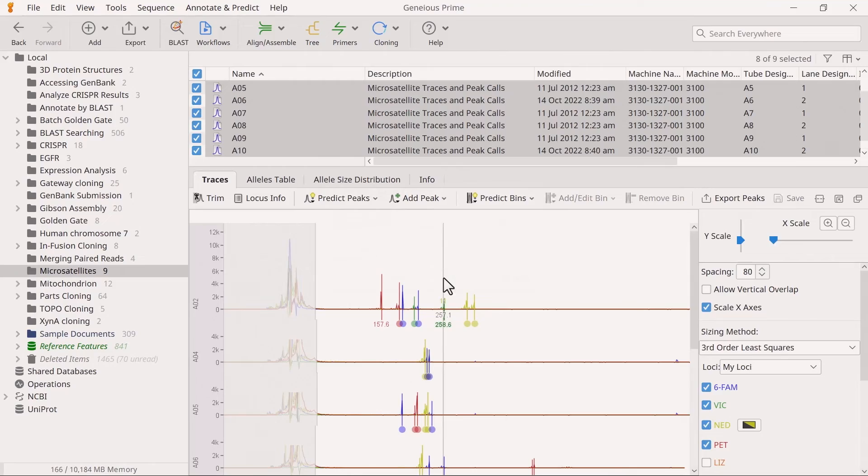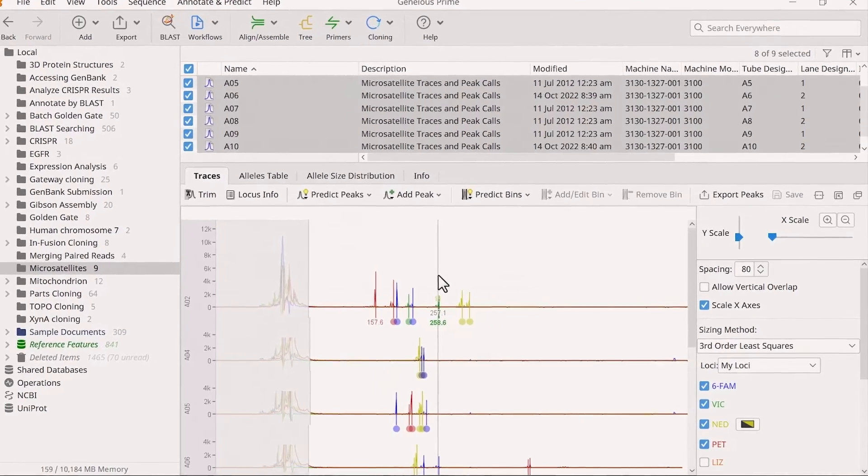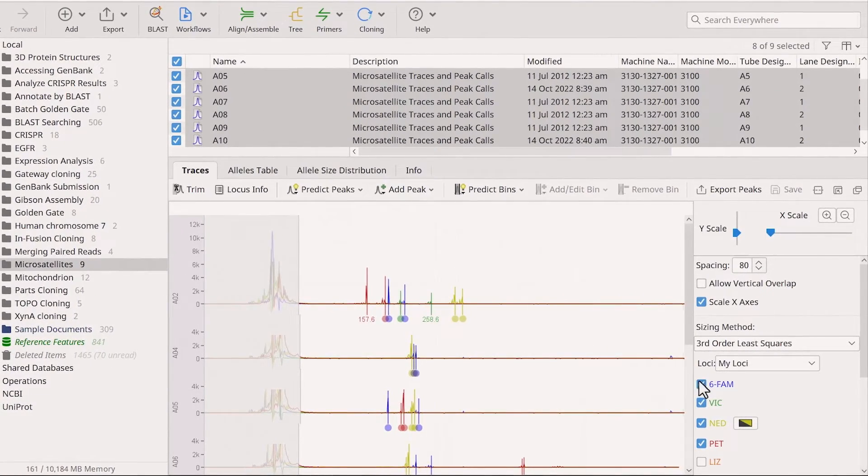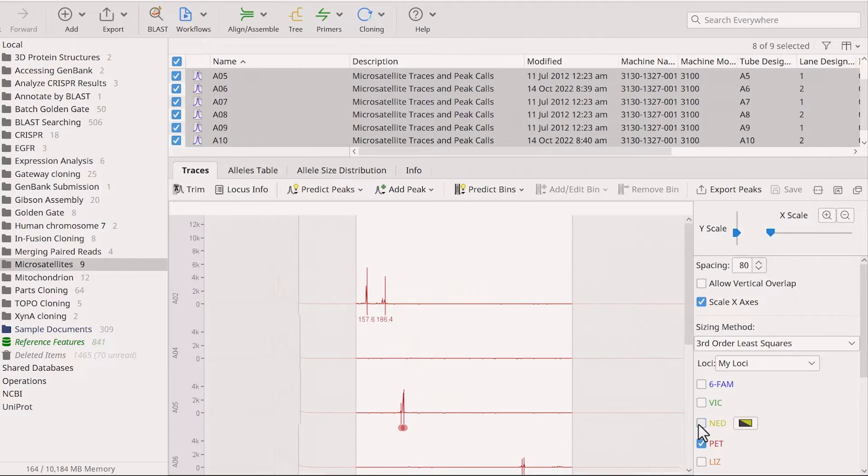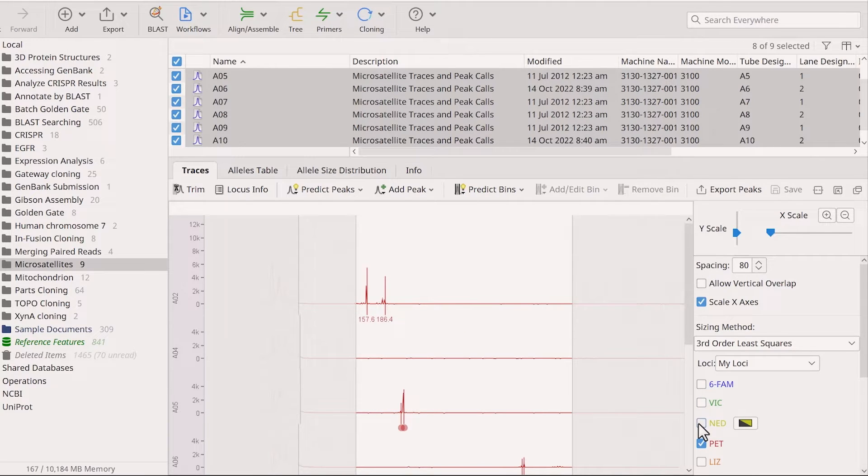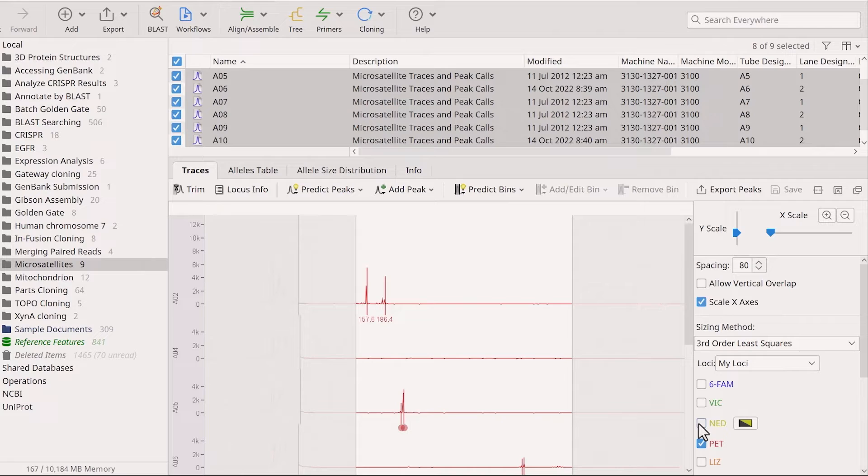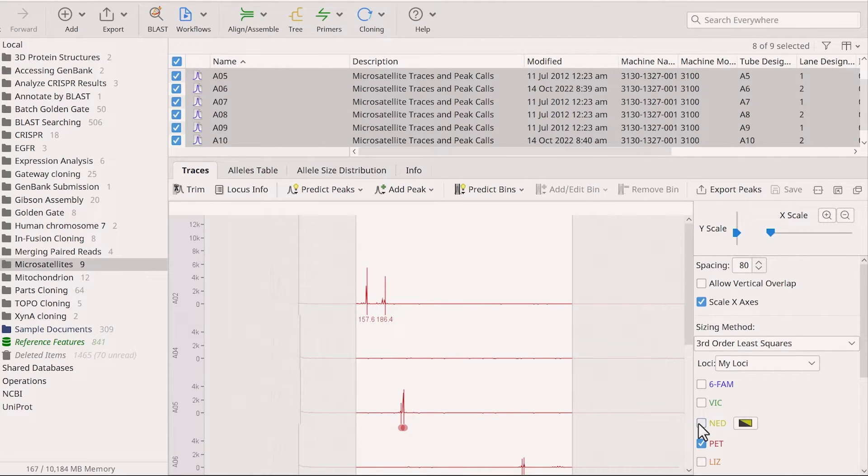With the loci set, go through your data one trace at a time and look for any known data artifacts such as plus-A, stutter or slippage peaks, and pull-ups. You will need to correct any incorrect peaks before you can perform binning.